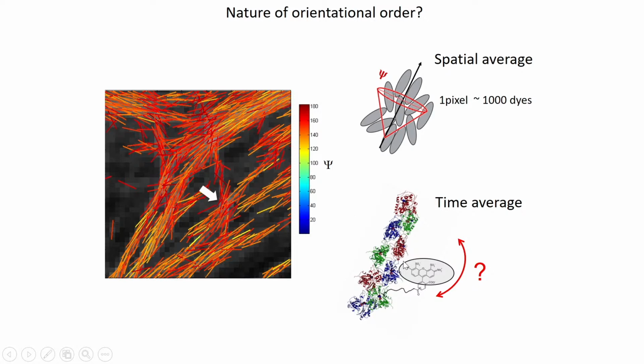But as I mentioned on actin earlier, this can as well be a disorganization at the time level, which is floppiness of the dye. And these two levels cannot be disentangled in these ensemble measurements. This is something that, of course, can be circumvented by looking at relative measurements. However, defining per se a structure which will resemble electron microscopy is not entirely possible at this stage if we do not know how much wobbling angle is explored by the single molecules.